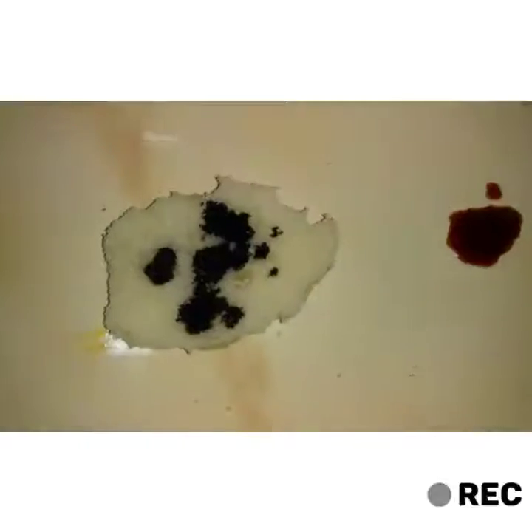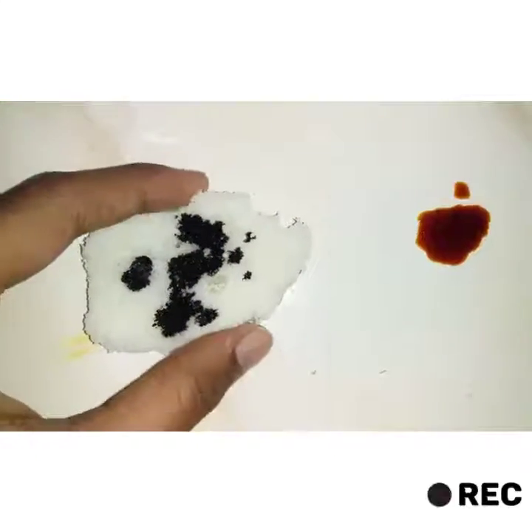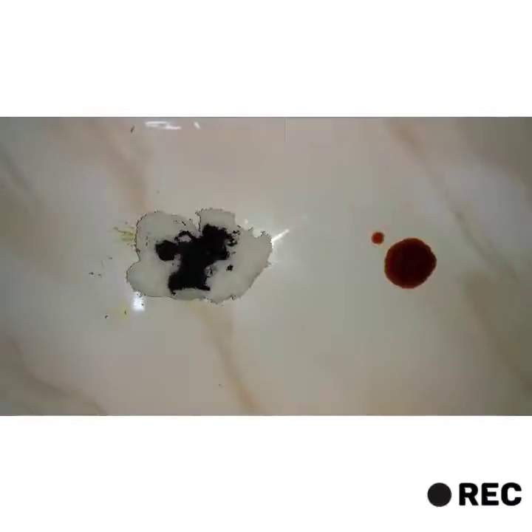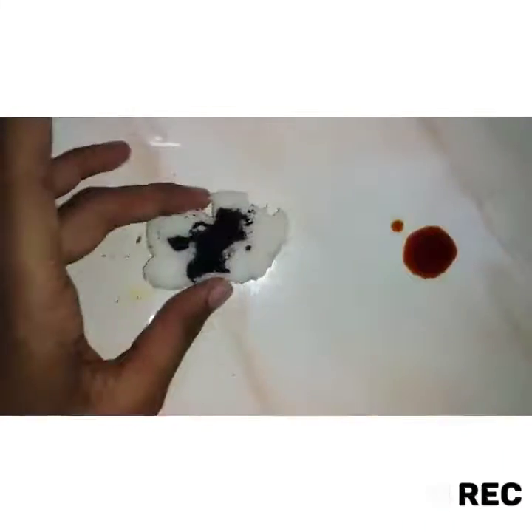We can conclude that iodine solution changes to purplish blue in starch-containing food. With that we will end the video — thank you so much.